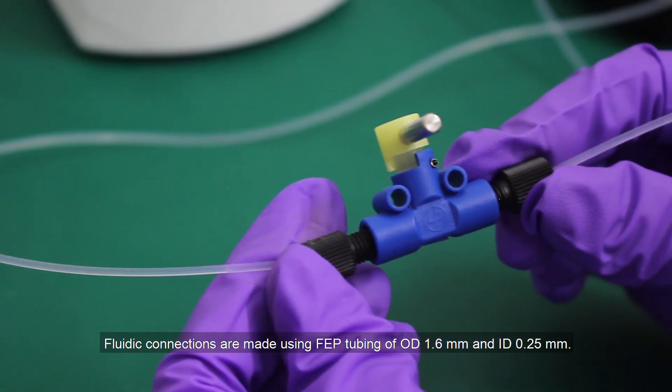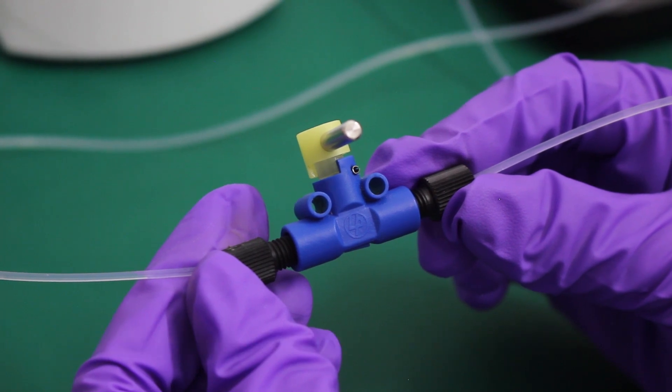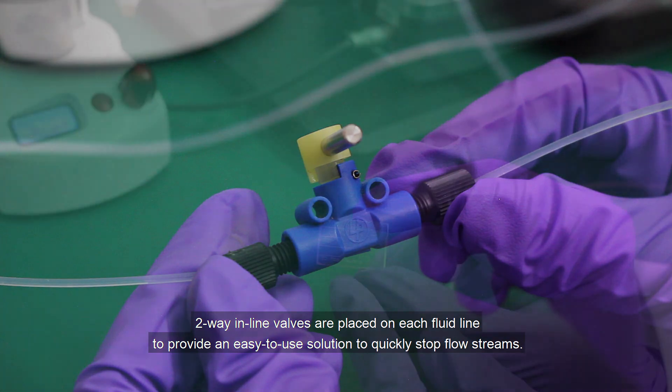Fluidic connections are made using FEP tubing of OD 1.6 mm and ID 0.25 mm. Two-way inline valves are placed on each fluid line to provide an easy-to-use solution to quickly stop the flow stream.